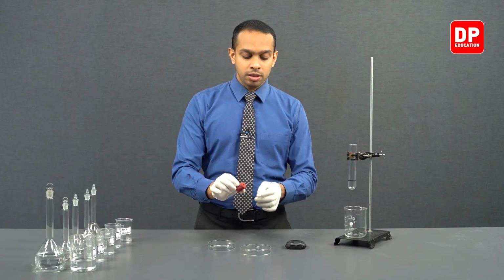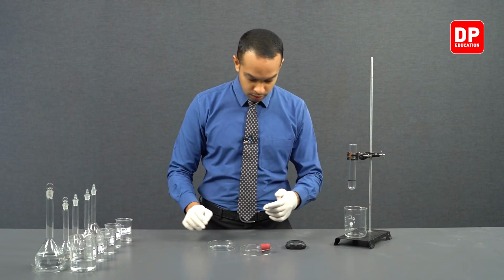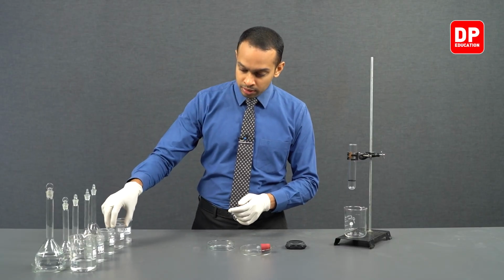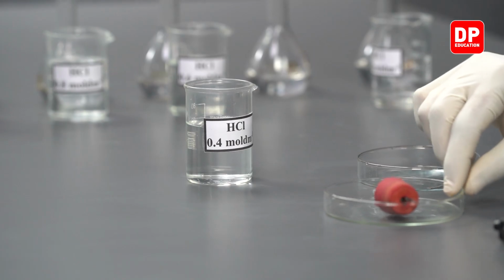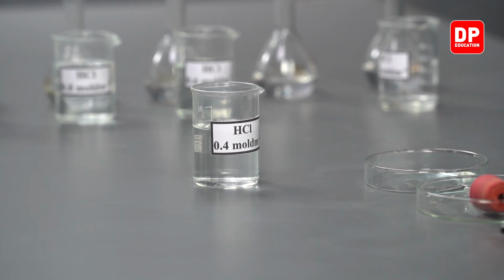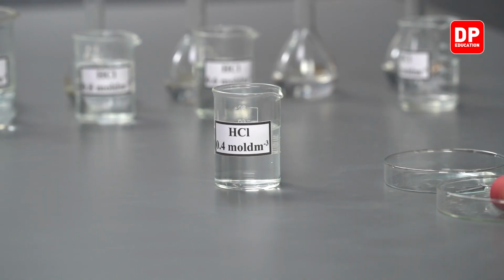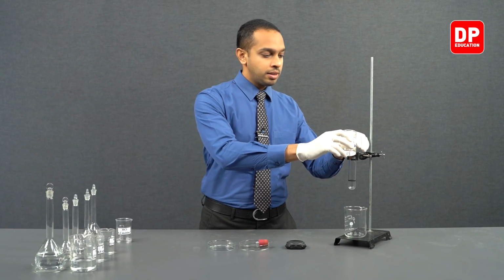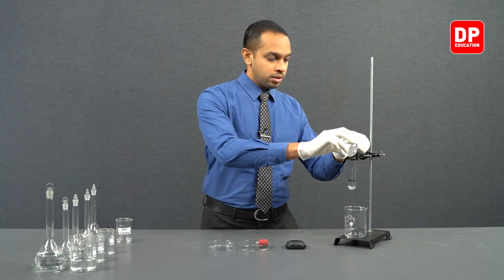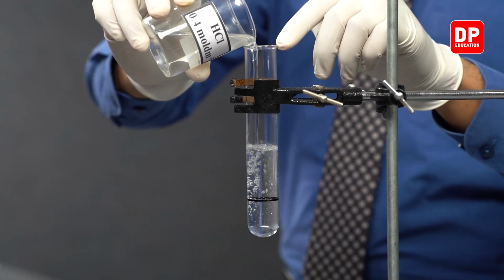Now we have fixed this magnesium strip onto our rubber stopper. We will be taking our 0.4 moles per decimeters cube HCl. After taking this HCl solution, we can add 0.4 moles per decimeters cube concentrated HCl all the way to the top.